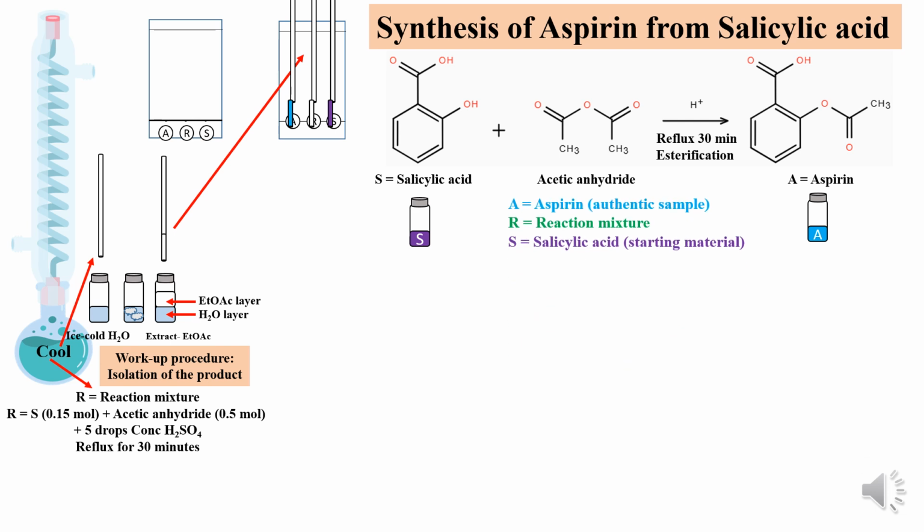A stands for aspirin, which is the authentic sample or the standard sample. R stands for reaction mixture, while S stands for the starting material, that is salicylic acid.